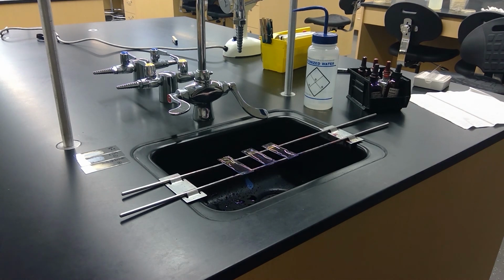We're at step 8. Pick up your slide and hold it at an angle over the sink. And then step 9 is carefully rinse the smear with decolorizing agent. Allow the reagent to run over the smear and drip off the end of the slide. Stop decolorizing when the runoff just starts to run clear. It'll be dark blue when you start.